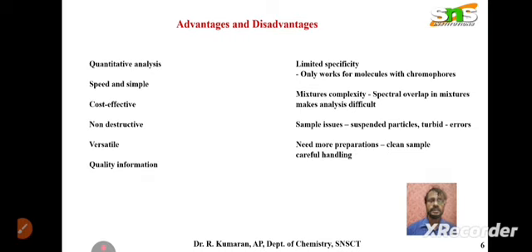We can rapidly take the confirmation analysis, and handling is very simple. It is a simple test, and the technique can be learned easily. It's not complicated like high-tech instrument applications. It's very easy to learn also. A basic researcher can learn this technique and handle it without any mistake.